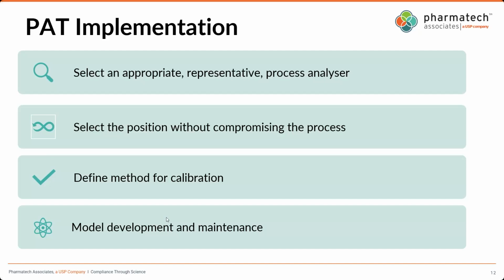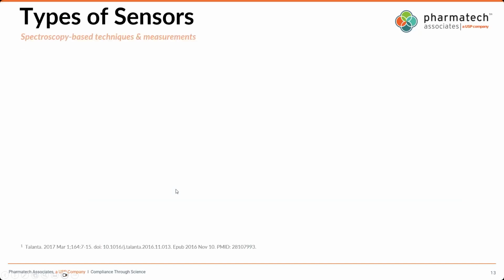But I think we want to view in the first step what sensor technologies are on the market for continuous manufacturing today. And this is where I want to hand over to Polly to give us some overview. What is the current state of PAT?